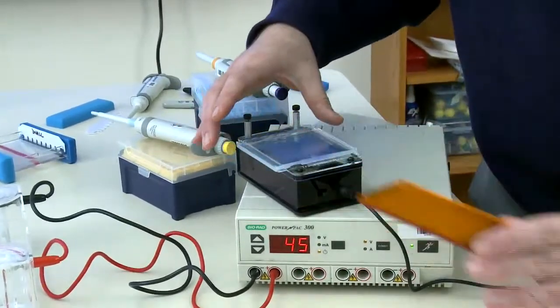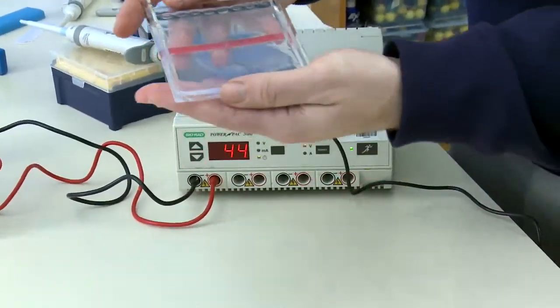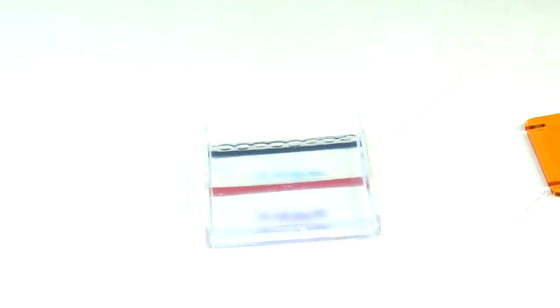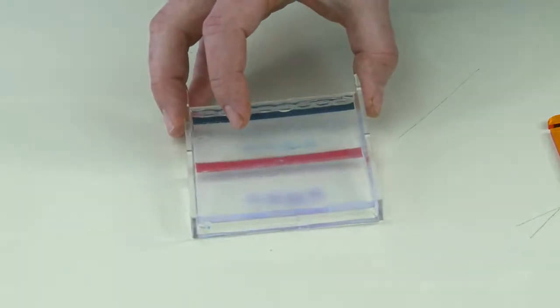Oh, actually, I wanted to show you first. I don't know if you guys can see this, but there is a blue and a purple line on the gel. So that blue and purple line essentially is the dye that we loaded into the gel previously. So one of the other functions of that loading dye is it tells you just how far or how long your gel has been running for.